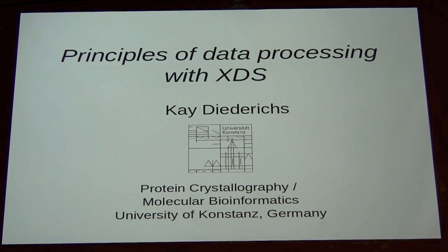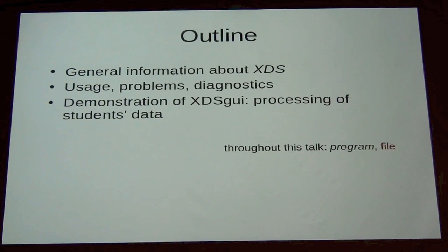who in the audience has used XDS? Oh, this was very different 5 years ago. Great. So I'll talk a little bit about XDS itself, the program, where it comes from and so on, then how to use it and what diagnostics you get, and finally finish showing this new XDS GUI, which is not as fancy as other GUIs, but I think it does a decent job. So for that I have some data sets here on this USB stick, and we'll look at those.